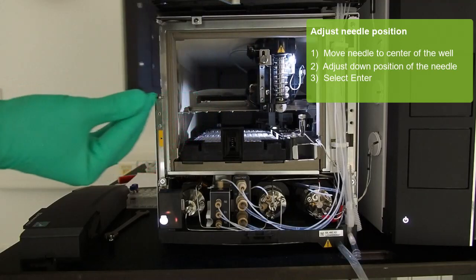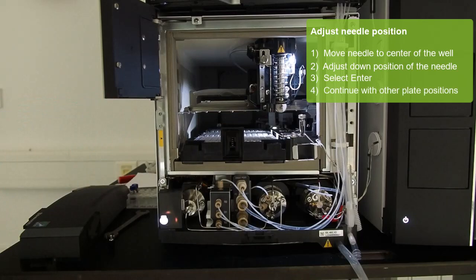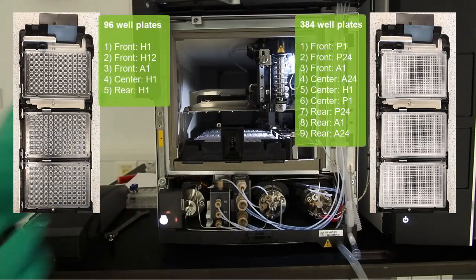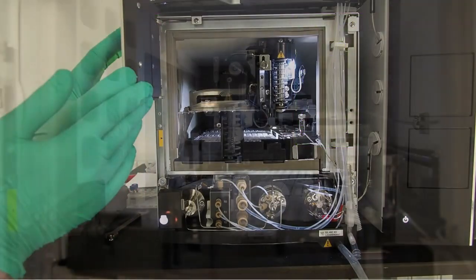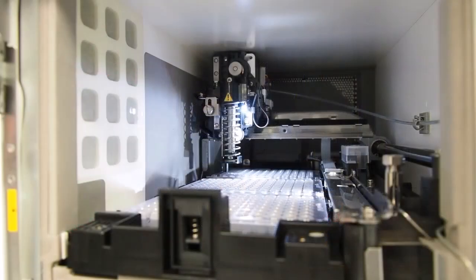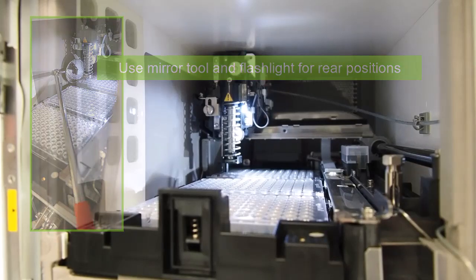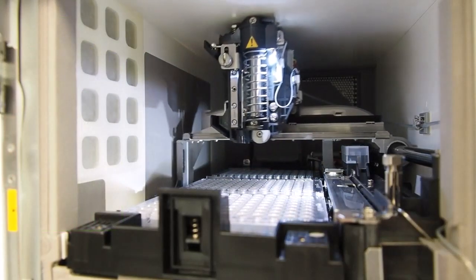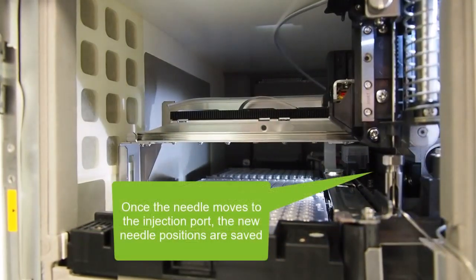The needle now moves to the next position that is to be centered. Continue adjusting the well positions as prompted on the control panel. The following positions will be used for 96 and 384 well plates. As the positions at the rear part of the auto-sampler are hard to see, it is best to use a mirror tool and a flashlight to find the best position. Once the adjustment is complete, you can see that the needle moves to the injection port. Now your changes are saved.